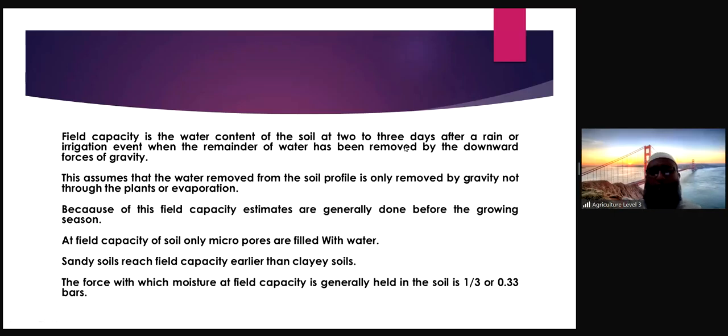And how can we determine this field capacity? We have a laboratory procedure for determining field capacity, and at the same time there are field methods. Farmers can easily do that.